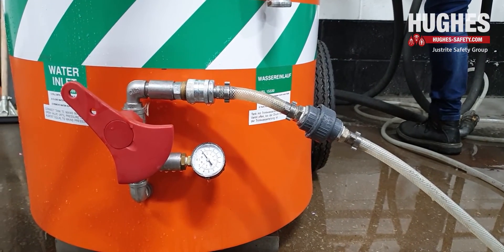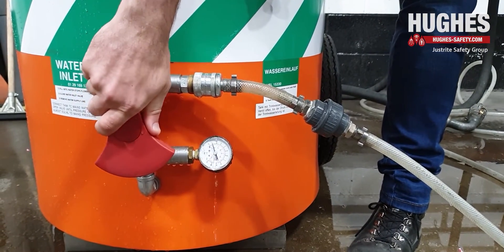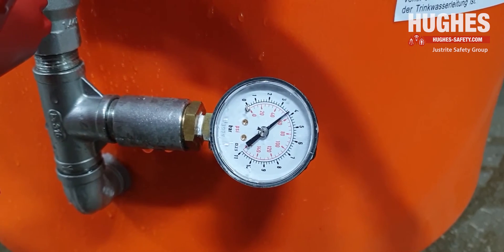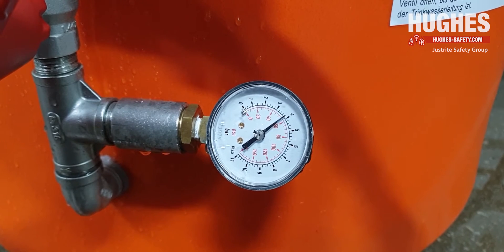The recommended water temperature is 15 to 35 degrees Celsius. Open the inlet valve and leave for about 20 minutes or until the water stops flowing. The nominal working water pressure for this unit is 4 bar G.